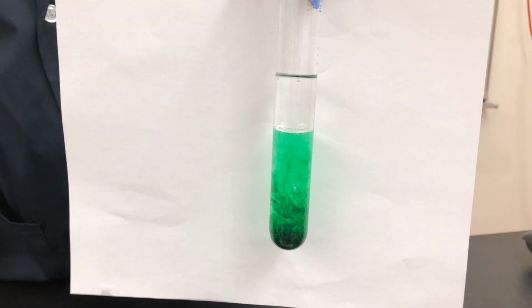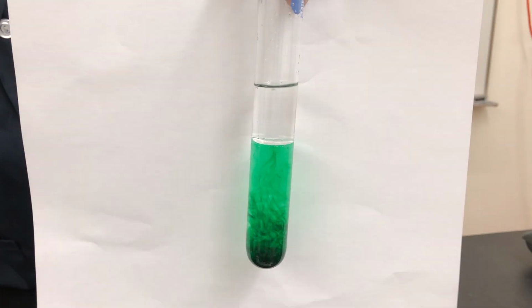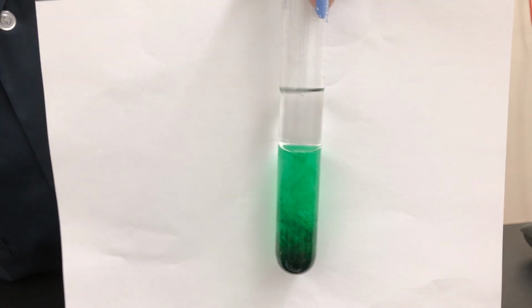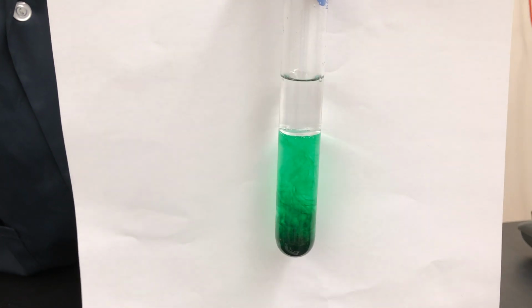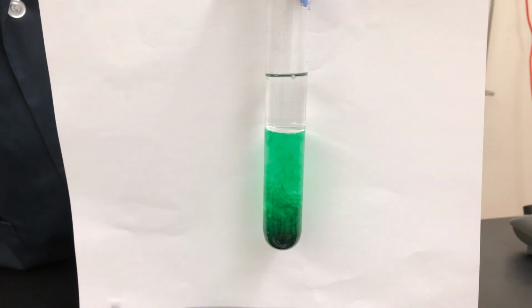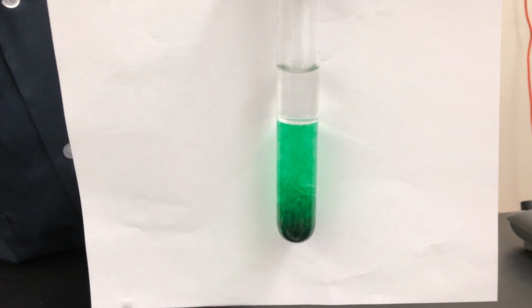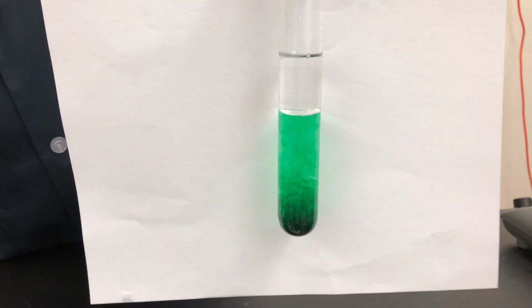So why is that? Why don't the hexane and the water combine? Some people like to say that that's density, and density is playing a role here. The difference in density is why the hexane is sitting on top of the water as opposed to underneath the water, but it's not why the two of those are not mixing.